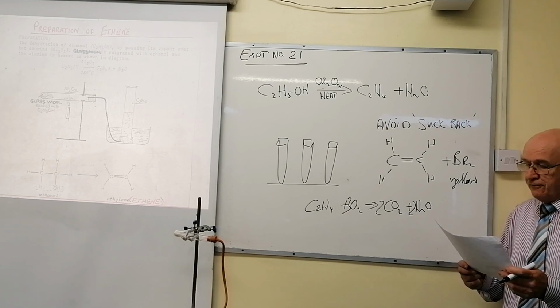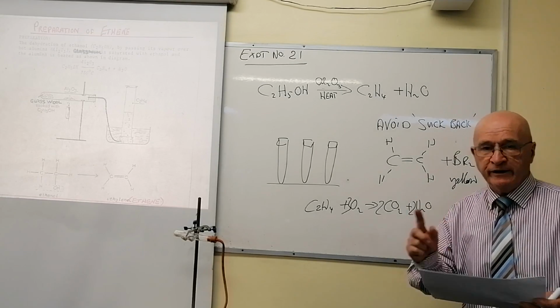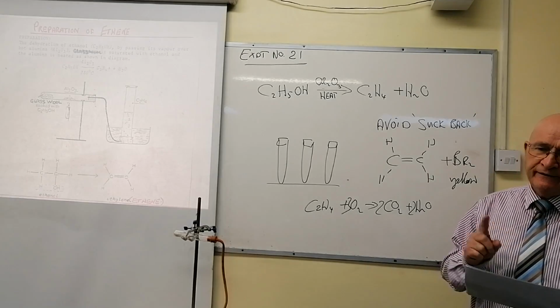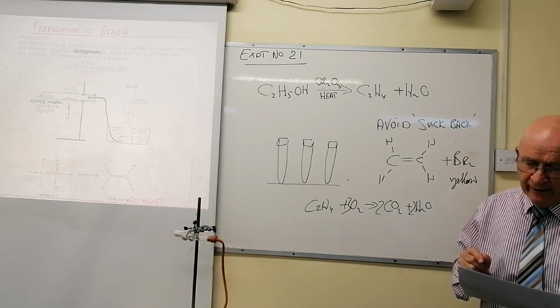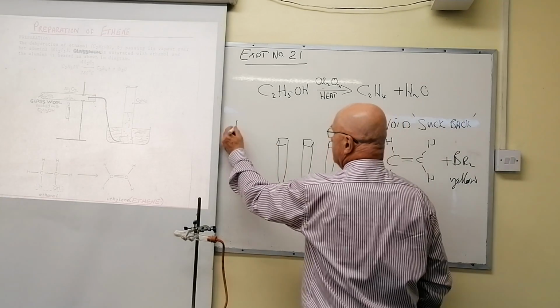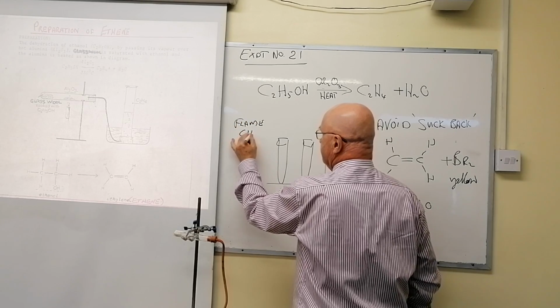Describe the colour of the flame. You get a clean flame. It's not smoky, in other words. It could be less bright than the second gas we'll use, and there's a blue tint to it. The flame is clean.